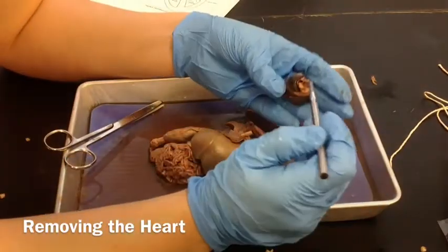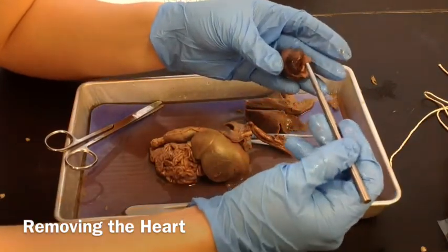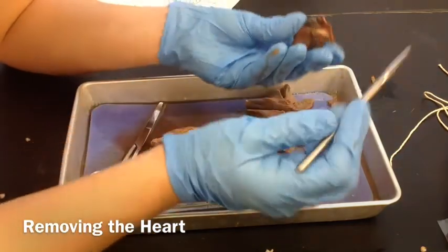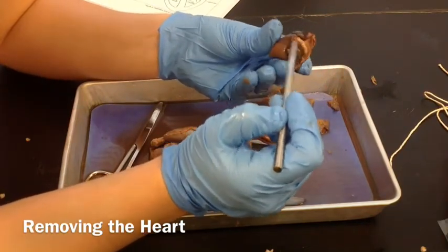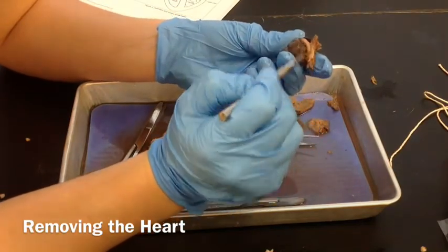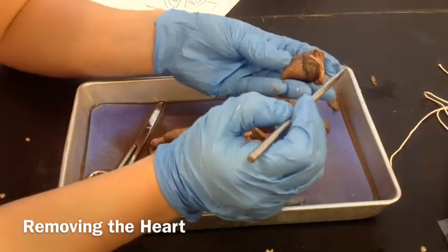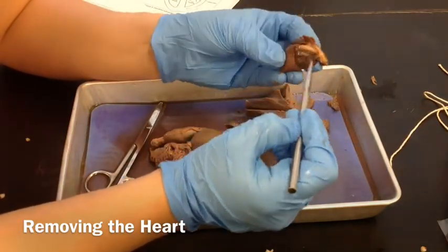Using our blunt probe, we can see that this is going into the right atrium. This also — the inferior vena cava — goes into the right atrium right there. Then you have your aorta that goes up and around and out. This is a pulmonary artery right here, and the aorta goes up and around behind right there. Those two arteries are very important. You also have some of the pulmonary arteries and veins that are going to come in and go through the left side.